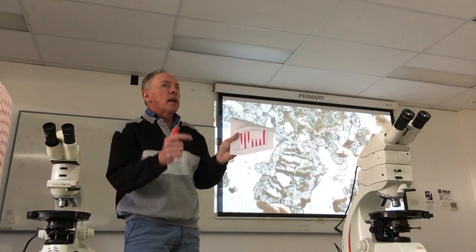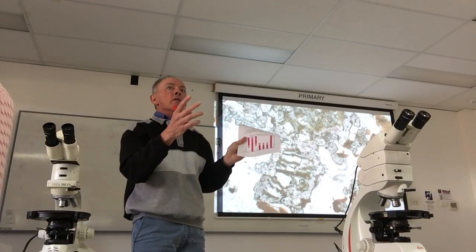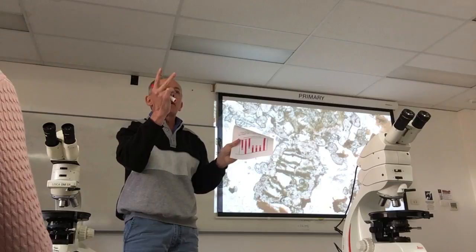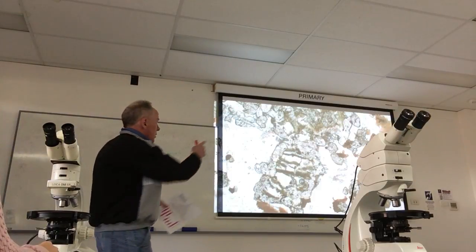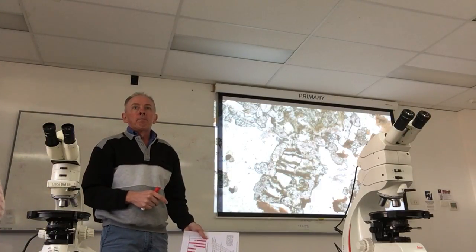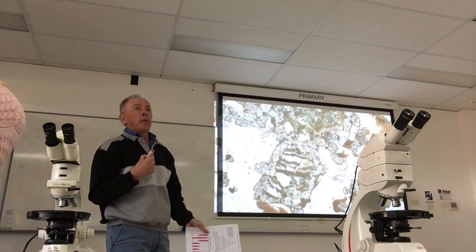Occasionally with the feldspars you might have a melt that goes what they call hypersolvus, and your two feldspars will be replaced by one, but that's fairly uncommon. In fact, this is what you'd probably call hypersolvus. There's no plagioclase in it because there's not much. Most of the calcium is being soaked up by the clinopyroxene that's in there.